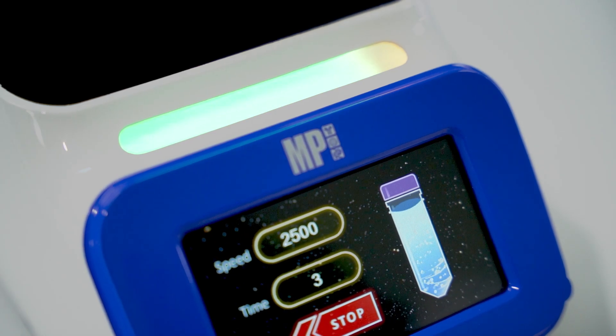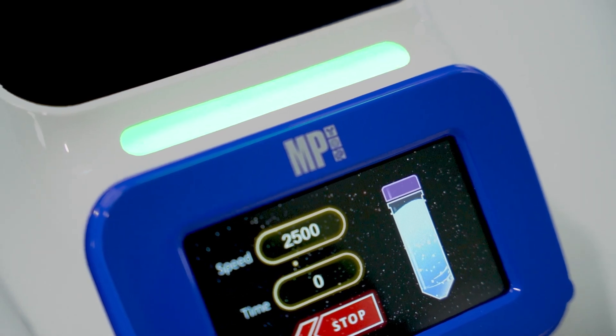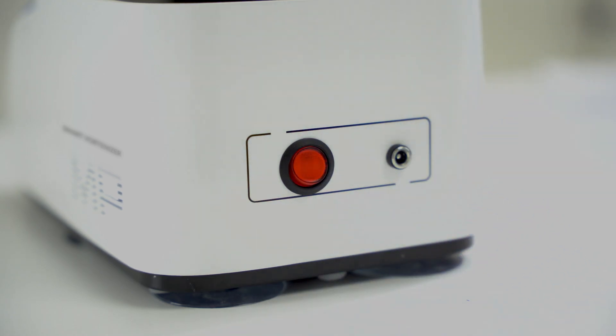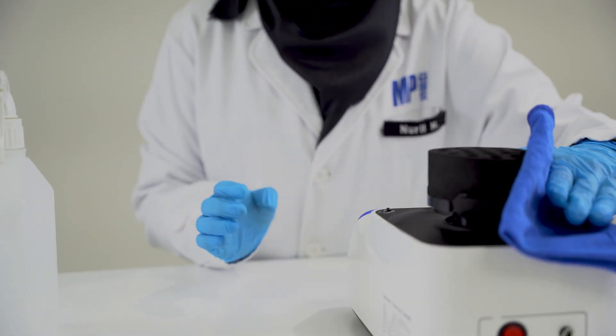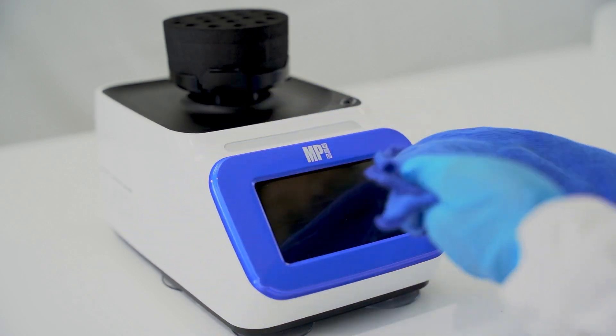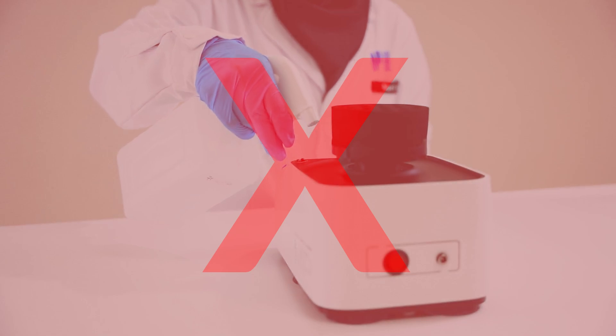Cleaning up after operation is a breeze with the Smart Vortanizer. To ensure your safety, make sure the power is turned off before cleaning. Wear gloves before wiping down the instrument's surface with a damp, soft cloth and a non-corrosive cleaning agent. Do not spray directly onto the instrument to prevent water damage to the machine's interior and LCD screen.